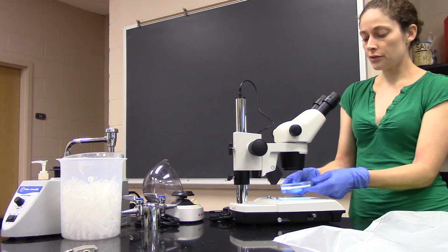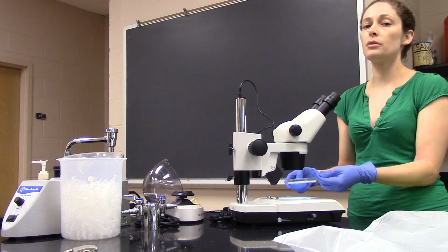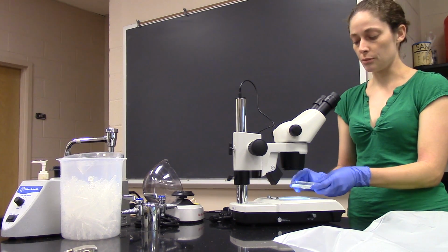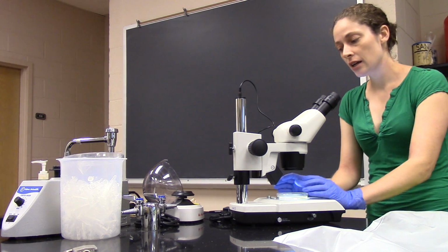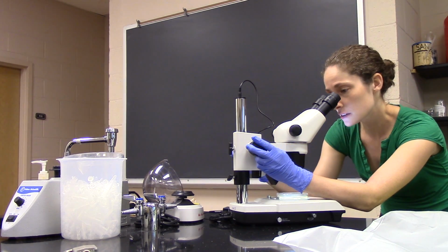Once you get something focused for this one plate, all of our plates, the agar is about at the same depth, so when you switch a different plate on, you should be very close to correctly focused. So you should only have to move your focus a little bit when you switch from plate to plate. All right, so I've got a plate. I know there's lots of worms on here for me to look at. I'm set to 10x magnification. I look through, and then I use these knobs to focus.